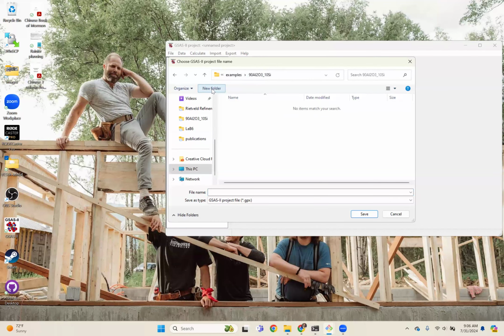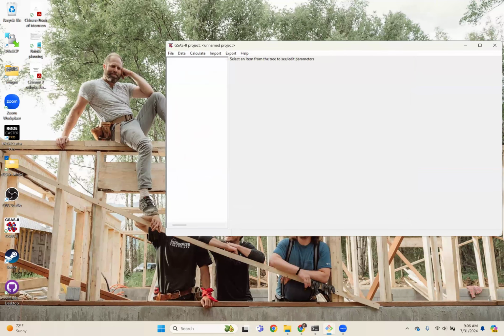I always like to make a second folder for where the actual refinement goes, because the refinement process creates a bunch of kind of junk files as it backs it up as it goes. So it's better just to put it somewhere where you don't care about those junk files existing. So I've got that created now. So now that we have that, I'm able to import my powder pattern and import my phases.